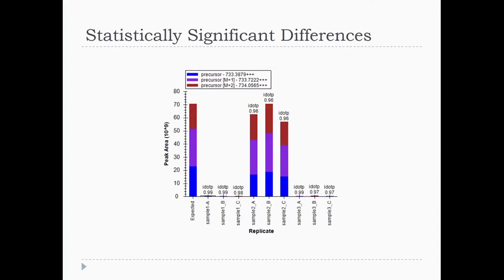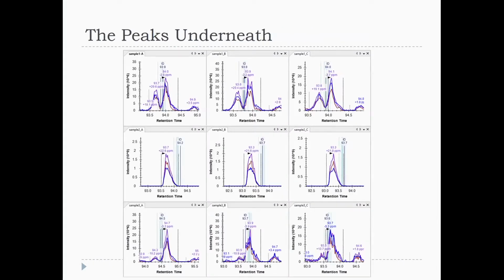So now you see, what you see is what you believe. You can't actually maybe come up with a hypothesis until you see more. So Skyline makes it easier for you to see more. What do people see now? Oh yeah, high mass error, look at that. 20 and 3 and 3. What else do you see?